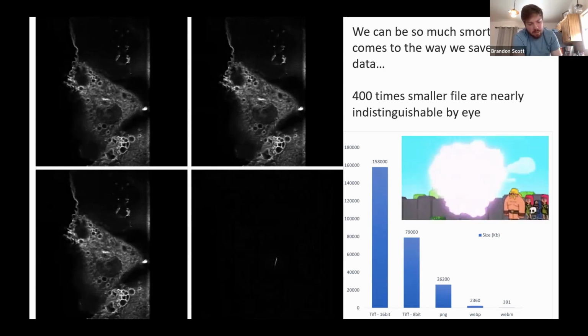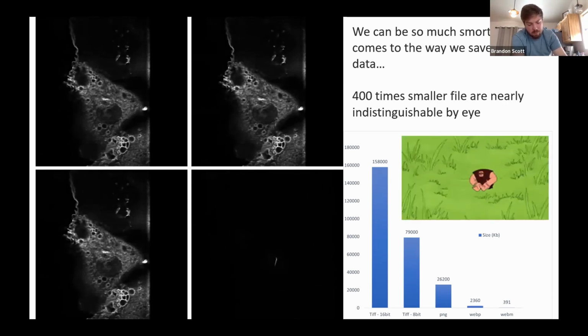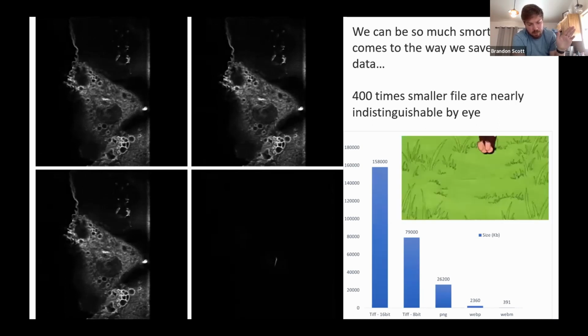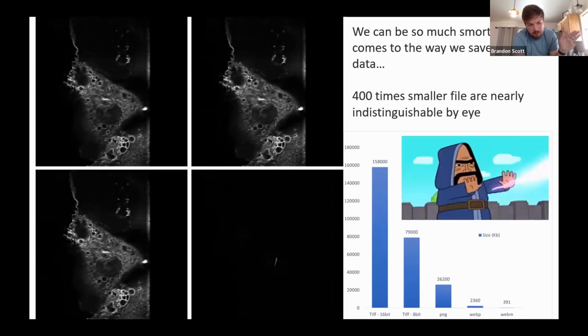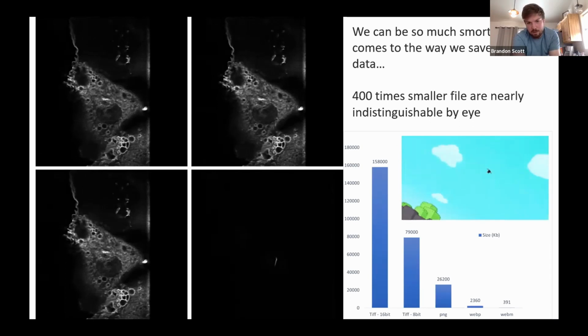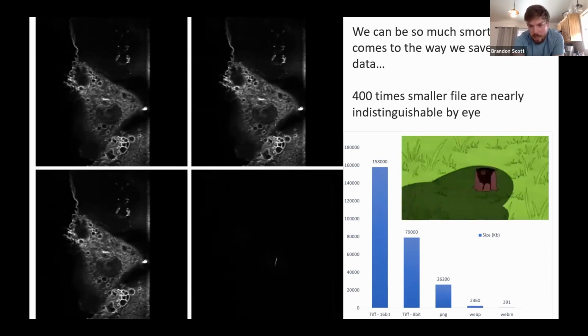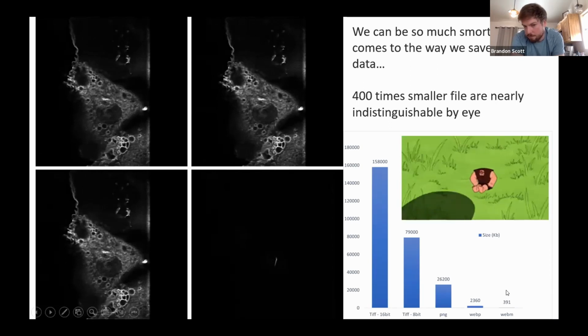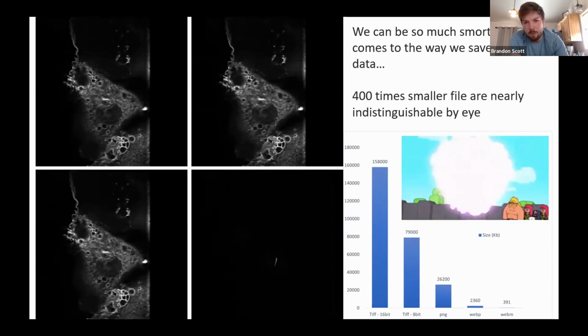When it's at 16-bit, when it is deconvolved and we need to upsample it, it becomes half a gigabyte or something stupid like that. And so now we're down to less than 400 kilobytes. So why do I care about that?